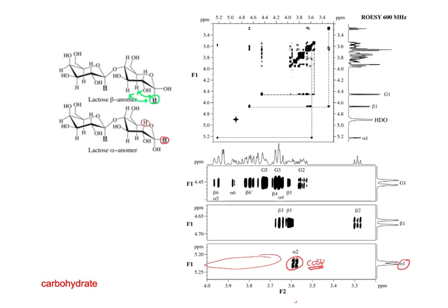Yeah, well, no, it's not really a matter of the number of bonds, because you can have molecules like DNA. It's proximity, space. I don't remember exactly how many angstroms away it has to be, but the relationship drops off to like the distance to the 6th power or something like that. So it drops off very rapidly.